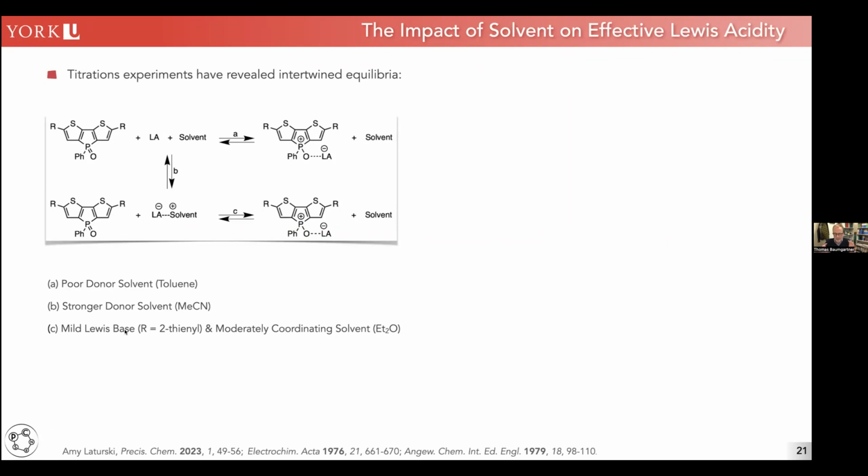But if you get the conditions just right, with the right base and a solvent like diethyl ether in this case, we were actually seeing two equilibria happening. So we were able to see this equilibrium and that equilibrium, because this one is not 0 or 100% as before. There's a certain portion, let's call it 50-50 for all intents and purposes. So you can see 50% of this is happening and 50% of that is happening. So the solvent does actually play a role here.